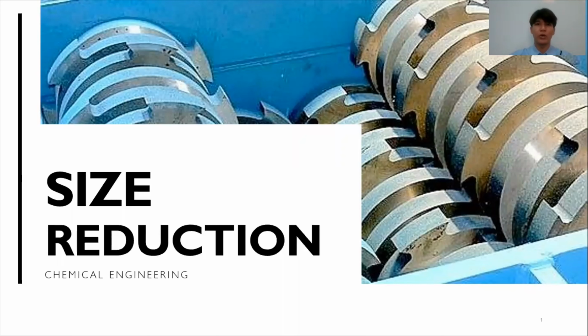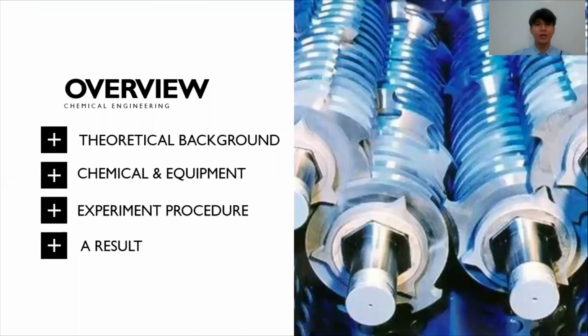In this experiment, we are required to break the hard sugar down to a smaller size by using a ball mill and then by using the sieve. Today's presentation covers four themes. Methavi Sivilat will talk about the theoretical background. Chayira Sritranun will talk about chemical equipment and experiment procedure. Pincha Chanakchai will talk about the result, and questions will be asked at the end of the presentation. Starting with the theoretical background, I will hand over to Methavi Sivilat.